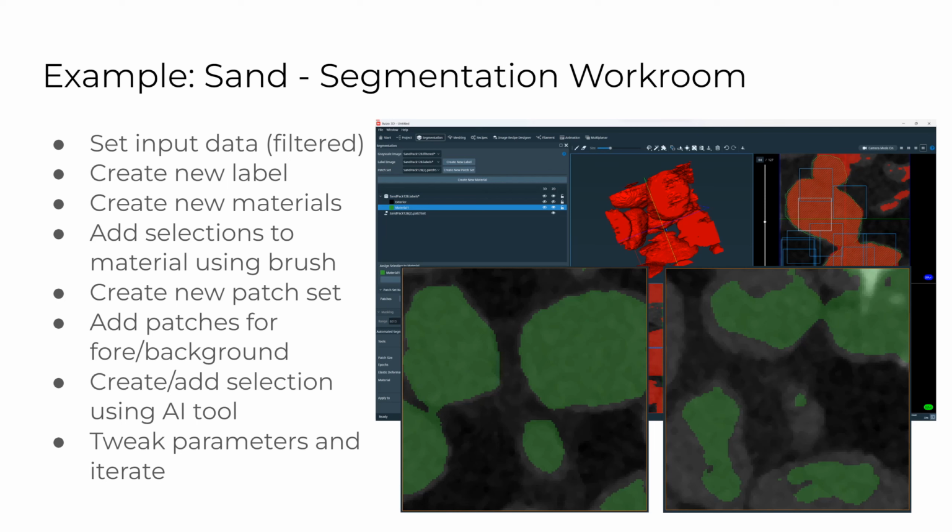I don't have much experience in trying bigger patch sizes, but if you just think about it logically, if the depth is the same and you're increasing the width and height of the image, computation should go higher. In general, I just played with the sizes 64 and 96.